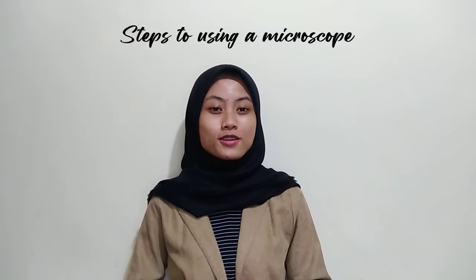Steps to using a microscope. First, turn on the microscope by pressing the on button. Second, place the object on the preparation table. Next, adjust the position of the preparation with the adjusting lever until it finds the right position. Next, bring the preparation table closer to the objective lens using the macrometer. Next, adjust the required exposure with the lamp intensity lever. And the last, sharpen the image of the object using the micrometer.